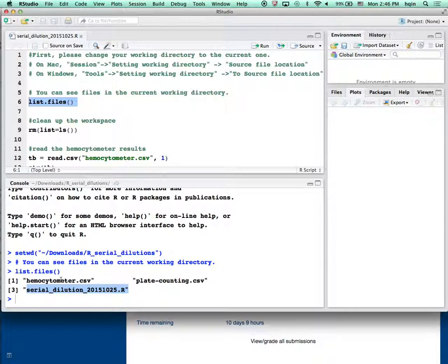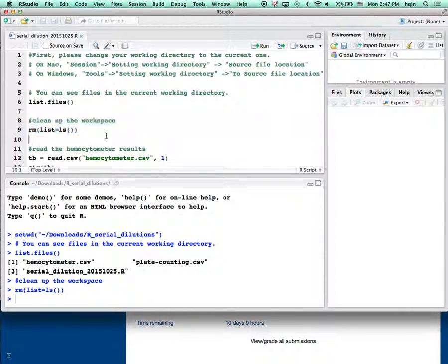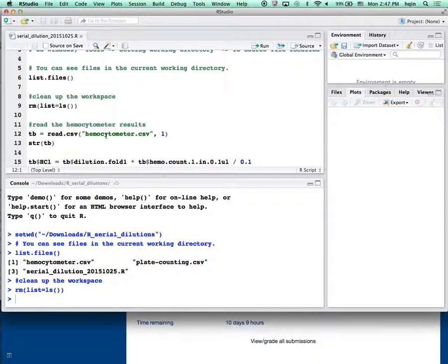I can also see two CSV files — that's basically an Excel data file for the serial dilution data. One is for hemocytometer and the other is for plate counting. Just in case, we also clean up the current working directory. This is unnecessary if you have never used RStudio before, but if you are running multiple scripts they can sometimes conflict with each other, so we start from a clean slate.